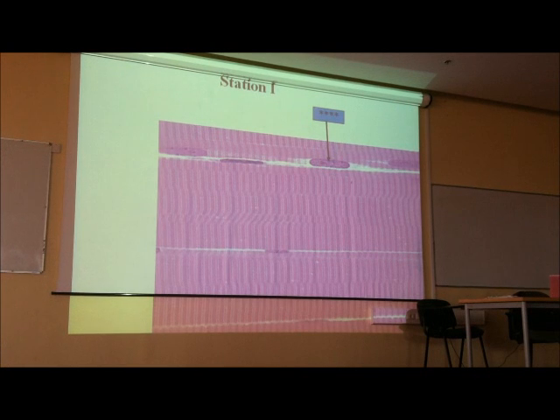Is it much better, or the previous one? This is much better. Okay.